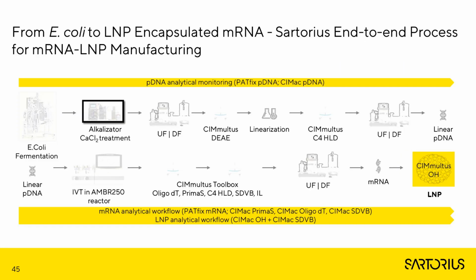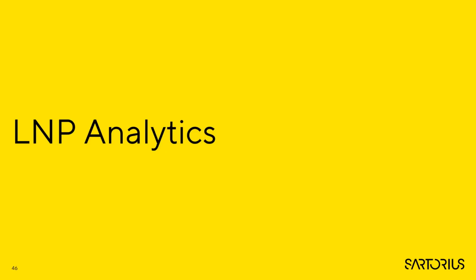So, Rock already described most of this. So our process for end-to-end manufacturing from E. coli to LNP, and I'm going to focus today more on the last part: the LNP analytical workflow and the LNP purification workflow.